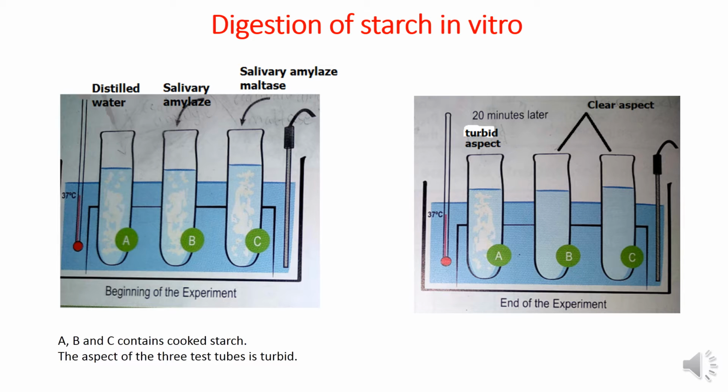Digestion of starch in vitro. In vitro means outside the body, as we said before. At the beginning of the experiment, at t equals 0, 3 test tubes are dipped in a bath of water at 37 degrees Celsius.